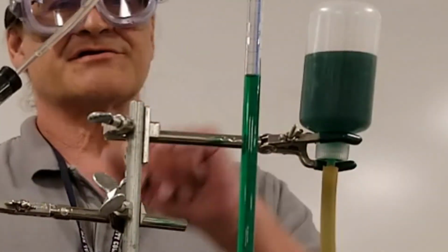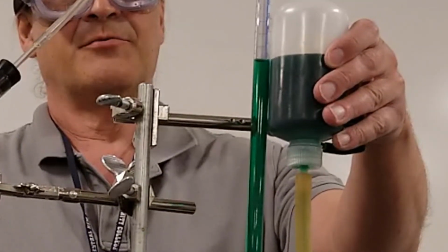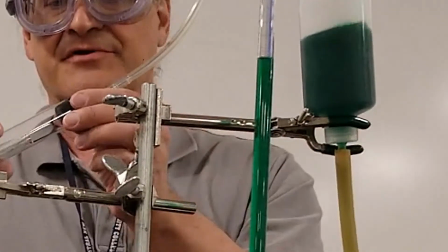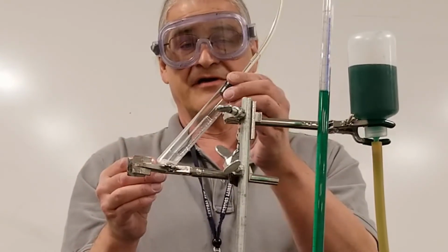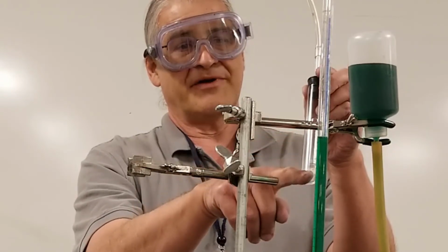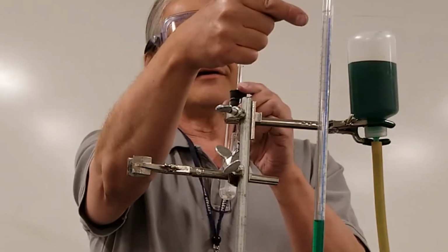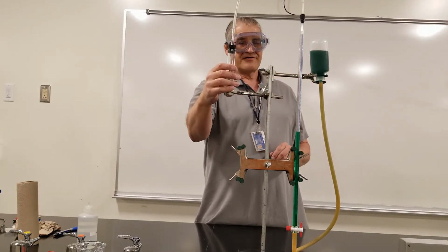Okay, we took the initial reading. Now, of course, we had to make sure the two liquid levels were the same. What that does is it assures us that the pressure on this side of the system is the same as the pressure here. Now, to run the reaction, we simply let this hydrochloric acid come in contact with the Alka Seltzer. And I hope you can see the water in the burette is dropping like a rock here. That's because, of course, the Alka Seltzer generates that carbon dioxide gas, which applies a pressure and pushes that down. So, still going down there.